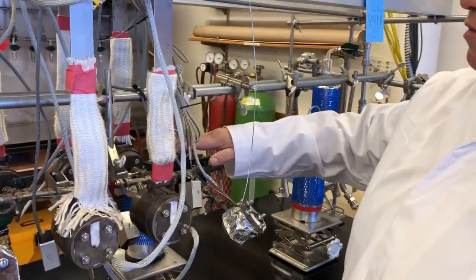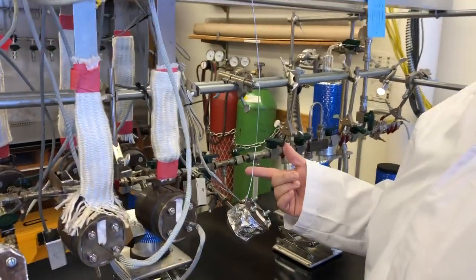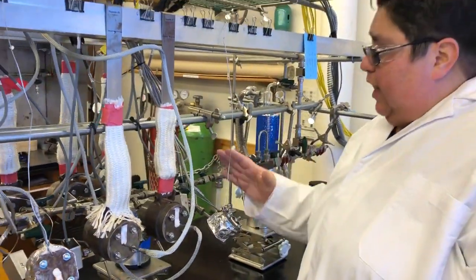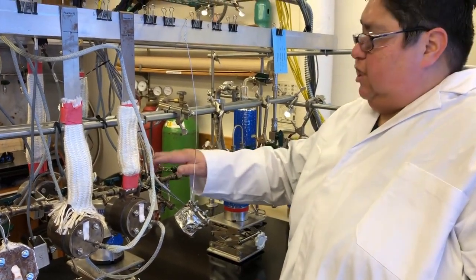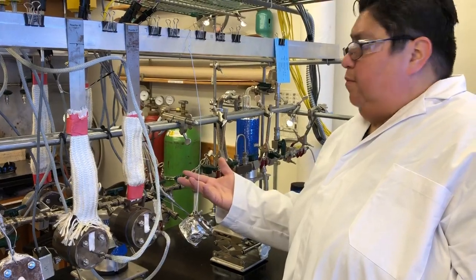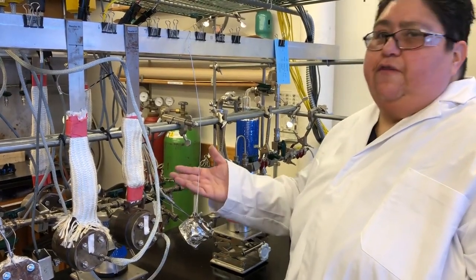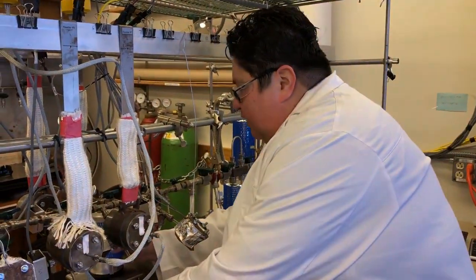So now I've got CO2 and iron in this reactor. I'm going to also add hydrogen to it. And once I apply heat, I've got heaters in here, once I apply heat to the CO2, the hydrogen will have graphite form. And that graphite is going to form on the iron catalyst.